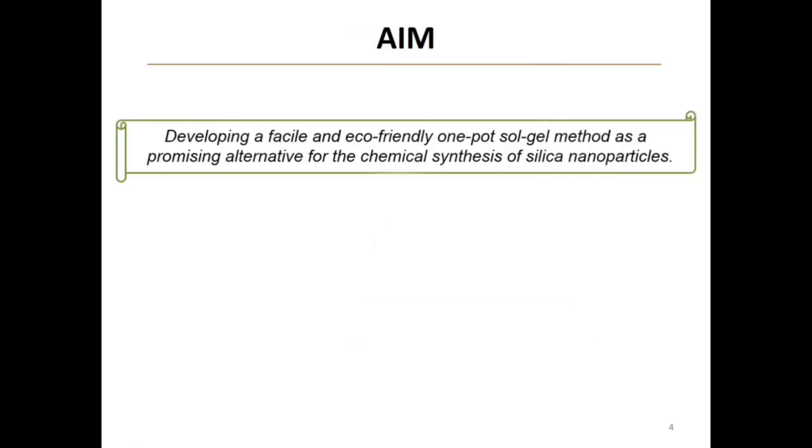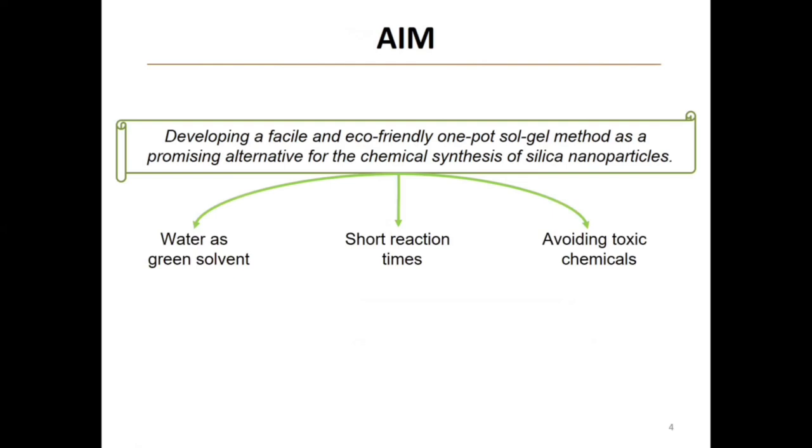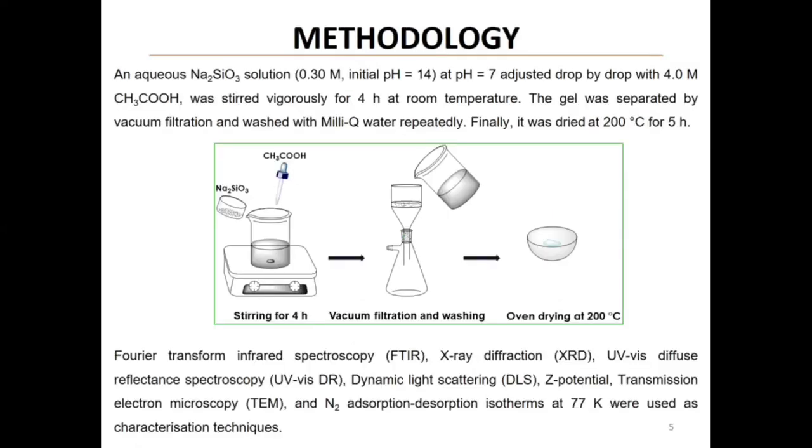In this work, we provide a facile and eco-friendly one-pot Sol-Gel method as a promising alternative for the chemical synthesis of silica nanoparticles. Under optimized synthesis conditions, an aqueous sodium metasilicate solution at pH 7, adjusted drop by drop with acetic acid, was stirred vigorously for 4 hours at room temperature. The gel was separated by vacuum filtration and washed with Milli-Q water repeatedly. Finally, it was dried in an oven at 200 degrees centigrade for 5 hours.